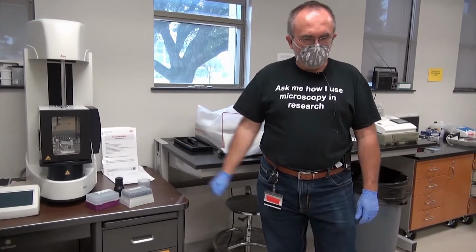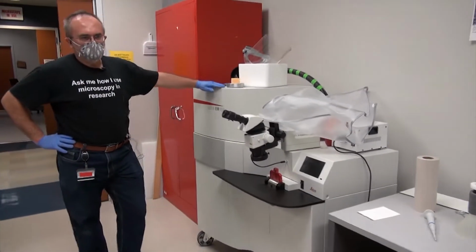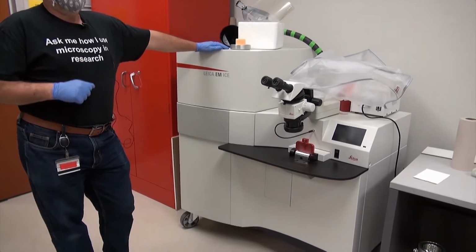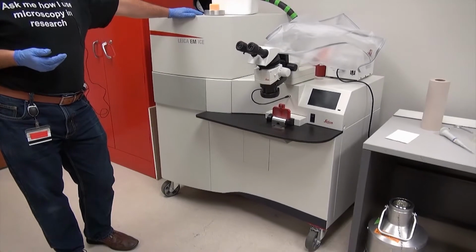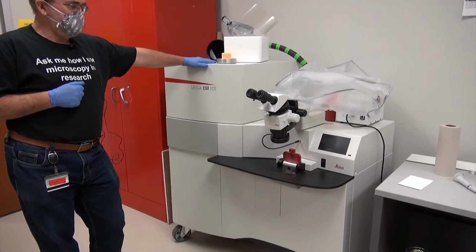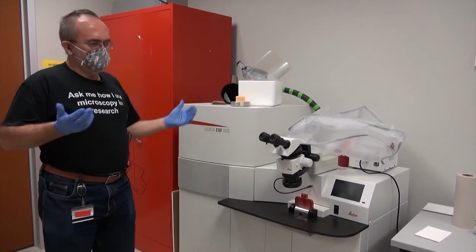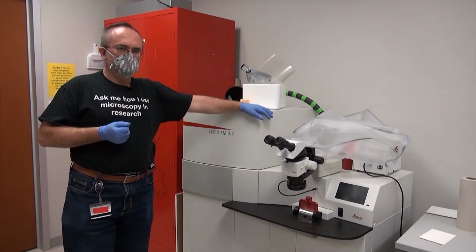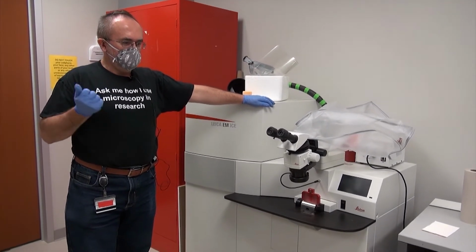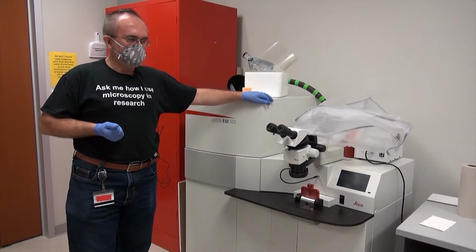In addition to this instrument, we also have the Leica high pressure freezing apparatus. This is for samples that are somewhat bulkier, because plunge freezing only works up to maybe several micrometers depth in a sample. In this case, we can vitrify the sample under high pressure at liquid nitrogen temperature, again without ice crystal formation. So this is considered the best possible sample preparation method for transmission electron microscopy. It avoids many of the artifacts that are associated with chemical fixation.